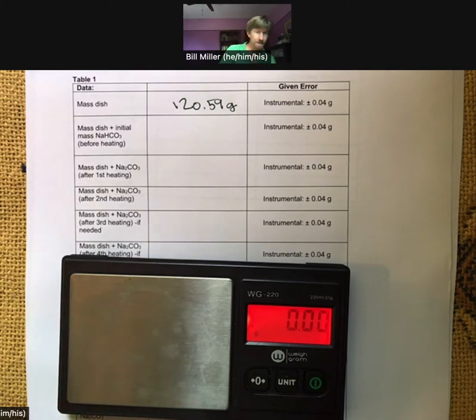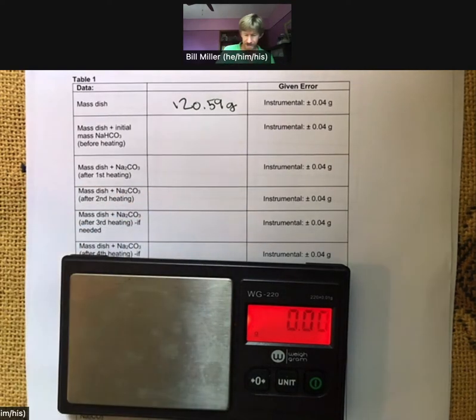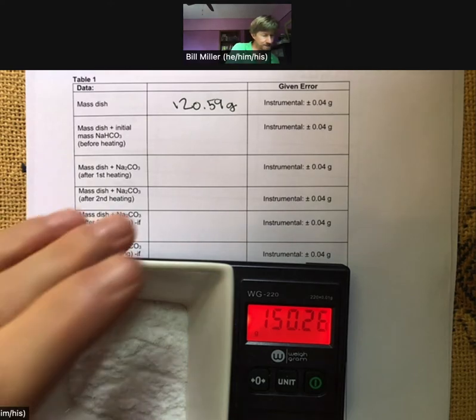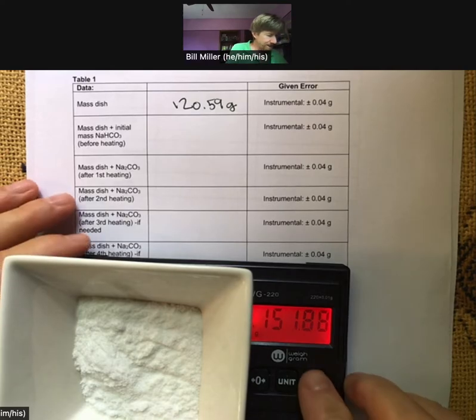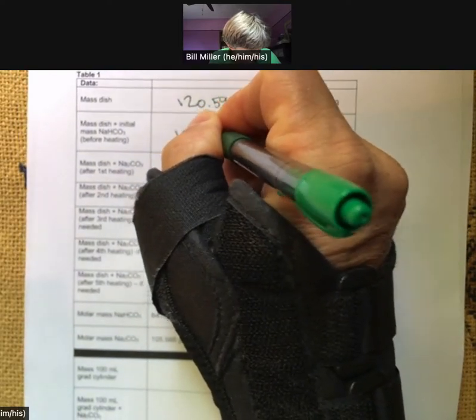Spilled a little on my lab procedure, but do not spill any on your scale. 127, that's why I'm taking it off every single time. Not too bad, just a tad bit under. Add a little bit more. Yeah, it's a little more than 30, but that's fine. I'll write that number down, 151.88. And that's before heating, right?